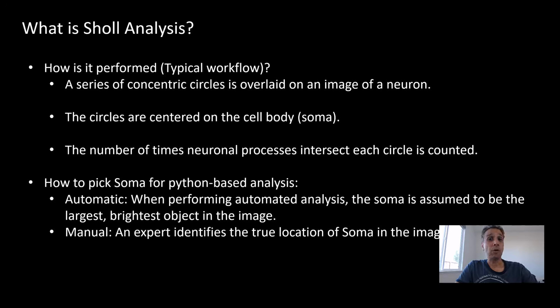Not all of those are reproducible, meaning if you send multiple images through your pipeline, you may not consistently get these results. In fact, you can actually combine deep learning with this analysis. Maybe I'll do a video on that in future, where you can consistently detect Soma almost accurately. I'm talking about traditional thresholding methods. It's near impossible, but with deep learning, you can get the location of Soma in an automated way.